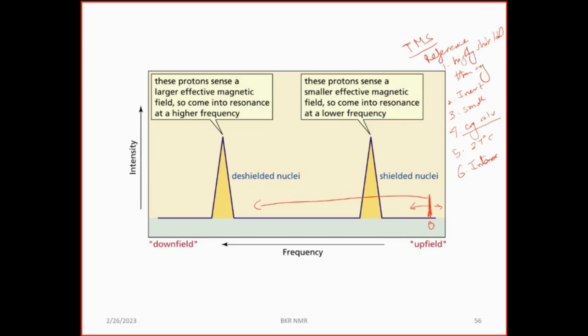For example, I'm going to use a radio frequency. Radio frequency is measured in hertz. So I don't want a value for the protons based on any dependable value. If I have an instrument working at 100 megahertz, I'll have one particular value. If I choose an instrument which is 800 megahertz, I'll have a different value. If the values representing a hydrogen depend on the frequency, then what will happen? That will be a bigger trouble for me.